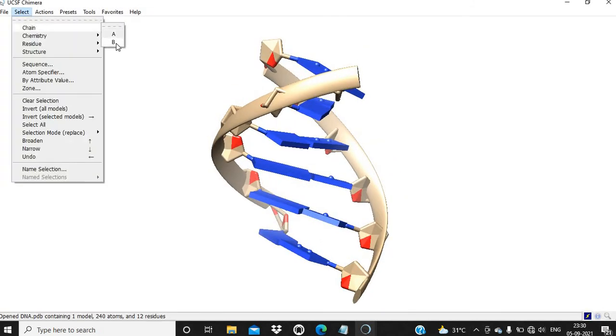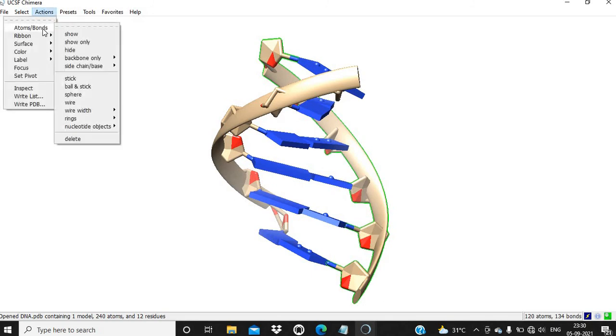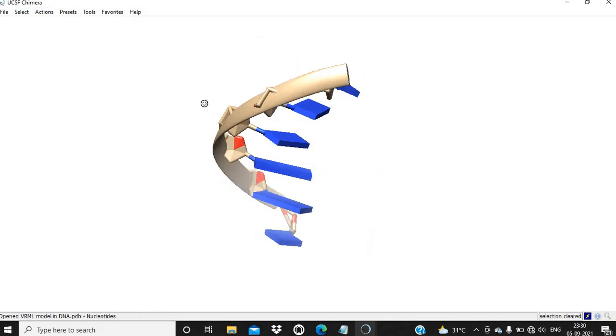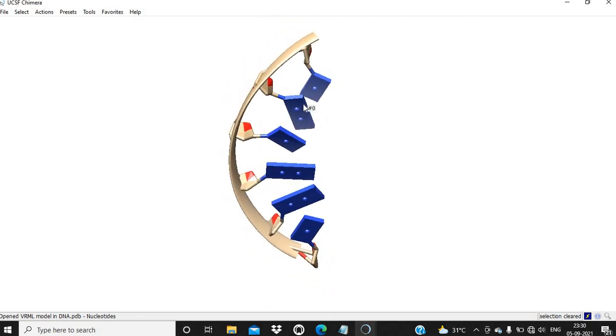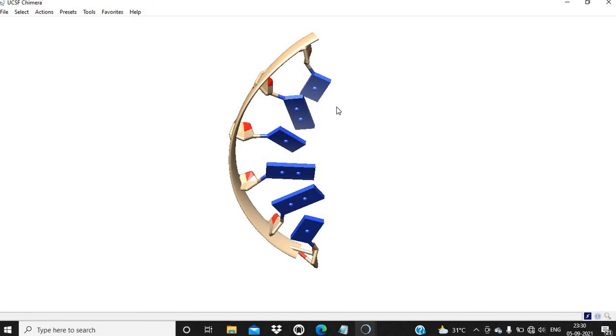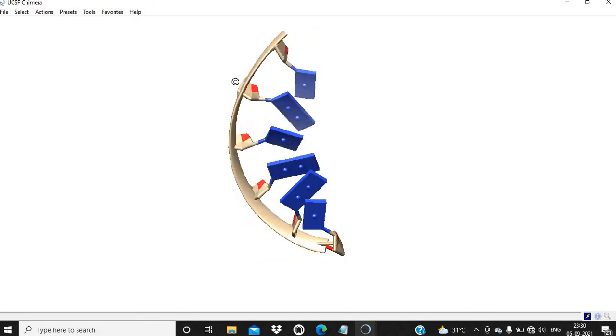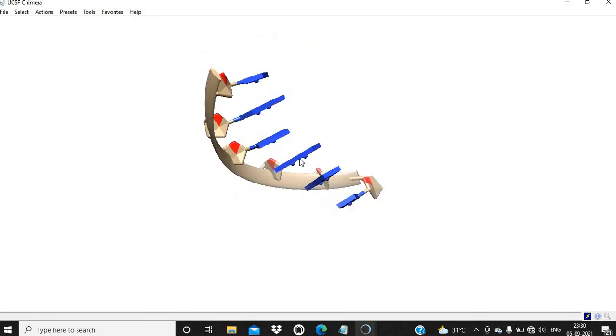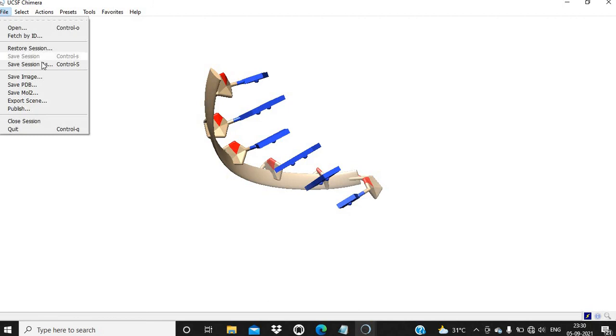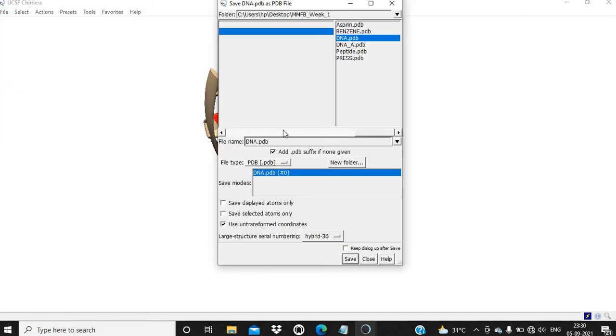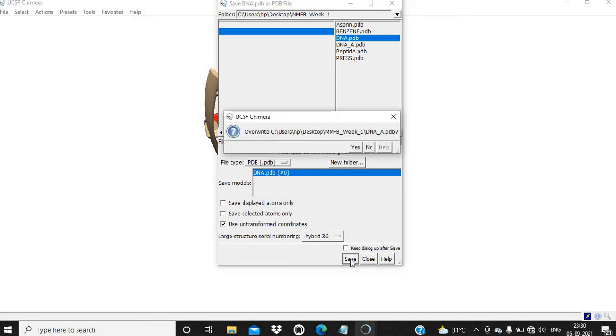We are again going to open the saved structure and delete one chain. We are going to delete chain B. Action, Atom Bonds, Delete. Now this is only one chain. Sometimes if only one strand of DNA is required, you can delete the other strand and keep one strand. Save it as dna_a.pdb where A is the chain identifier.